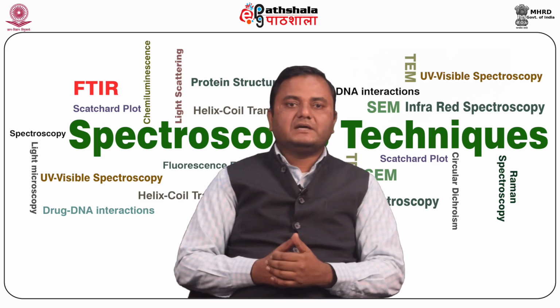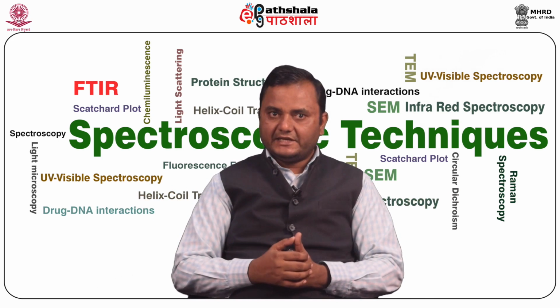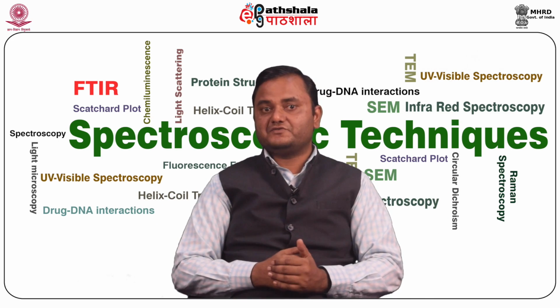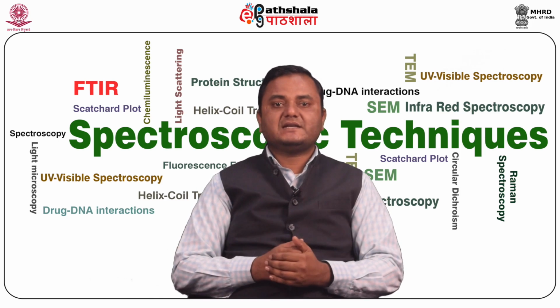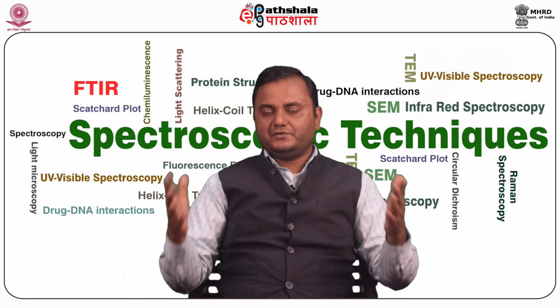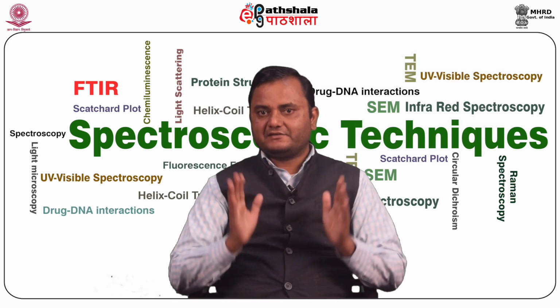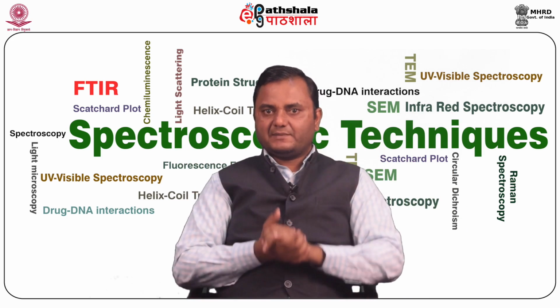Now we talk about the application of FTIR. FTIR is widely used in different areas, like in chemistry it is used for the identification of functional groups. It is also used for trace analysis of raw materials and finished products. For example, if you developed a product and you want to check that it does not have any contamination, then you scan for that particular wavelength.